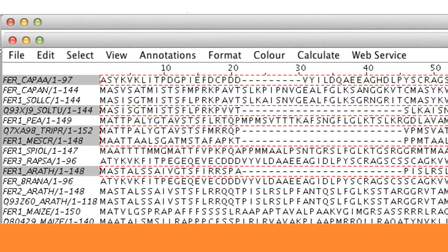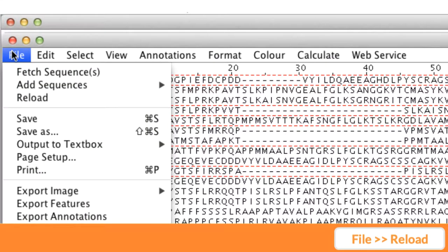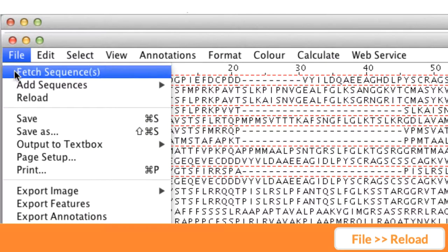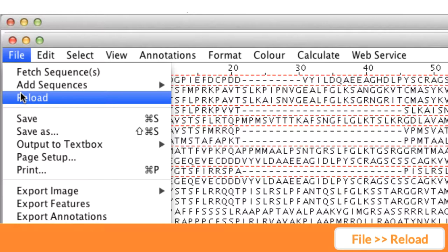If you want to go back to the original version, go to the File drop-down menu and select Reload function.